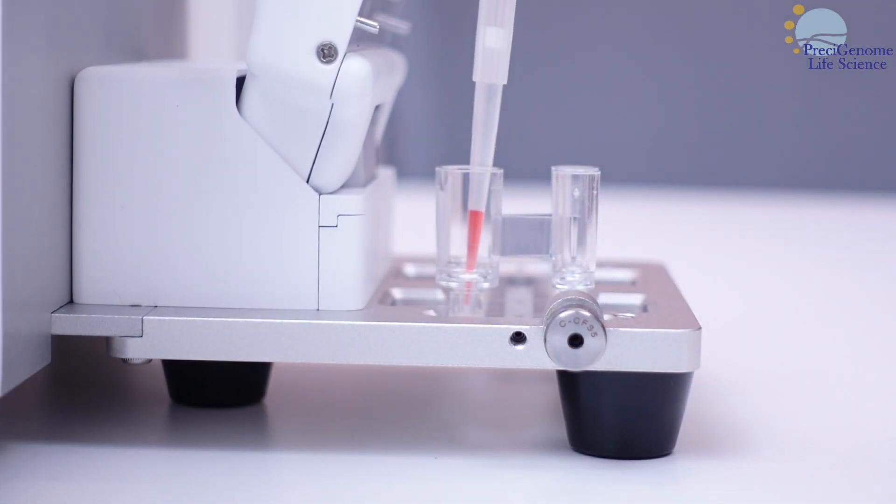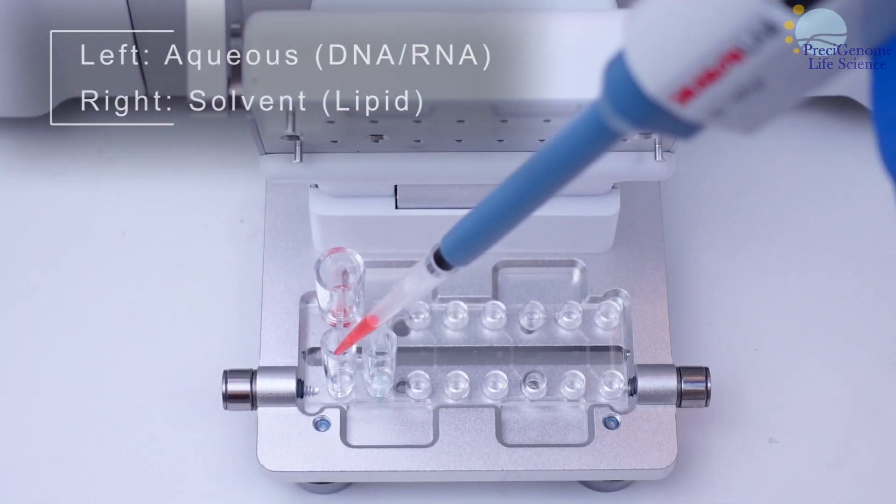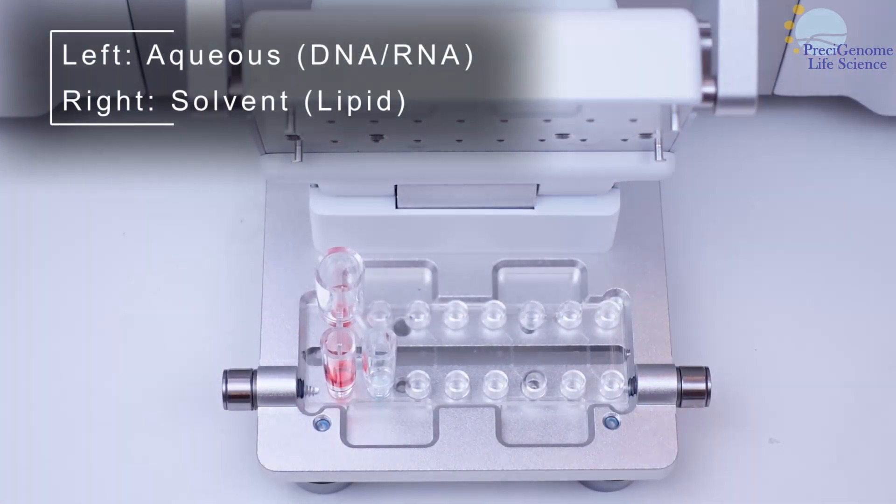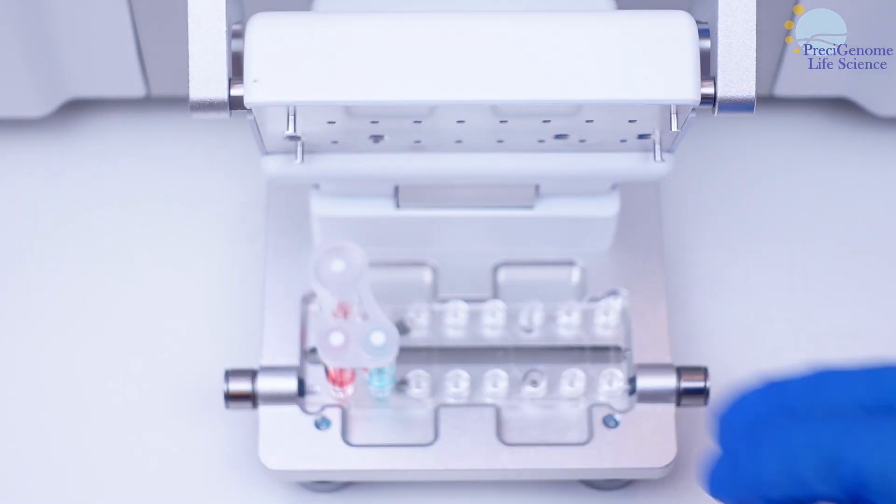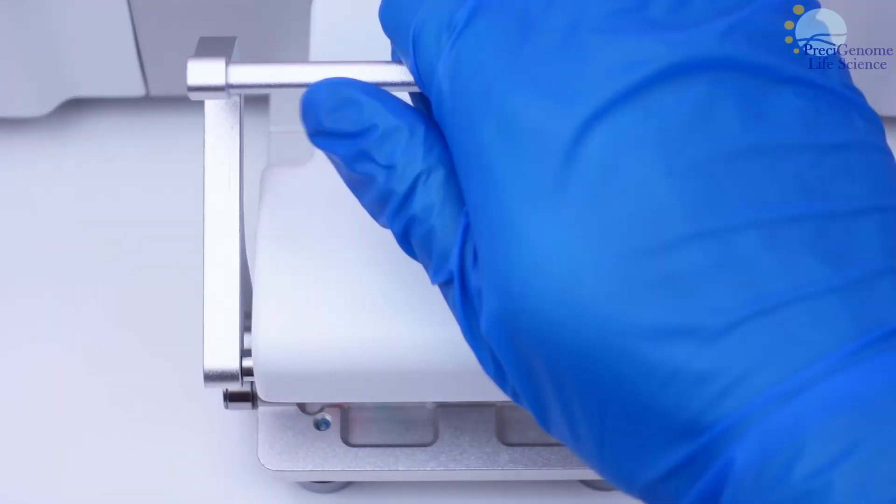When loading the reservoirs, first conduct inline dilution in the collection reservoir's chimney. Next, load the left reservoir with aqueous solution and the right with lipid solution. Cap the reservoirs with a gasket and lock the FlexS to ensure a proper seal.